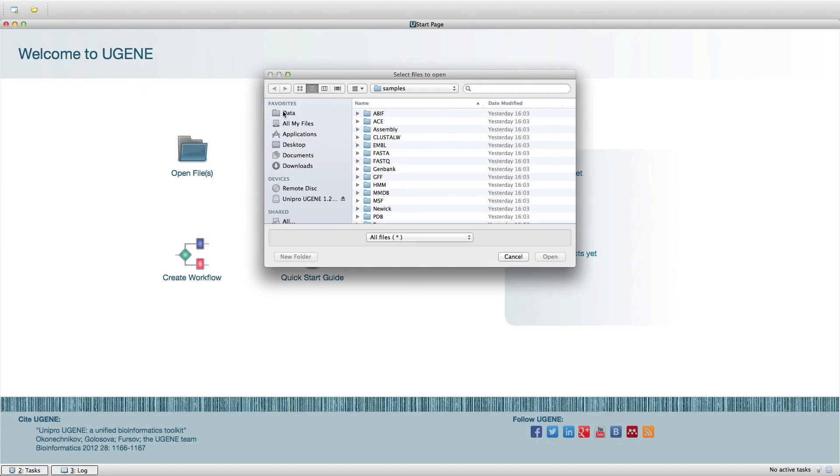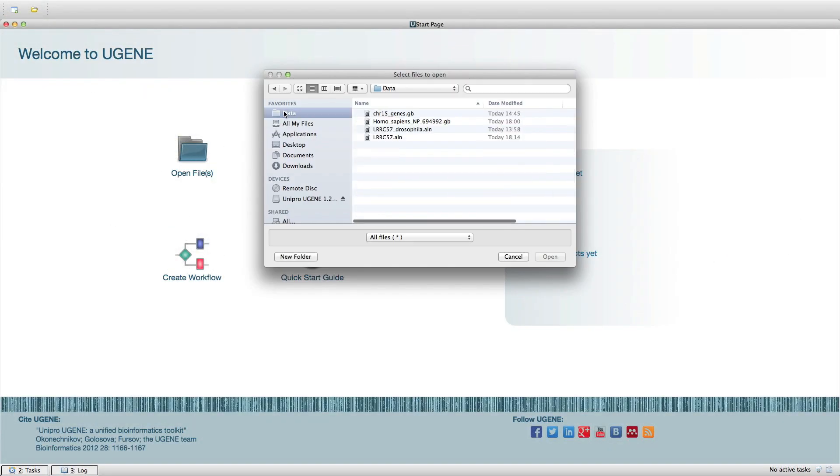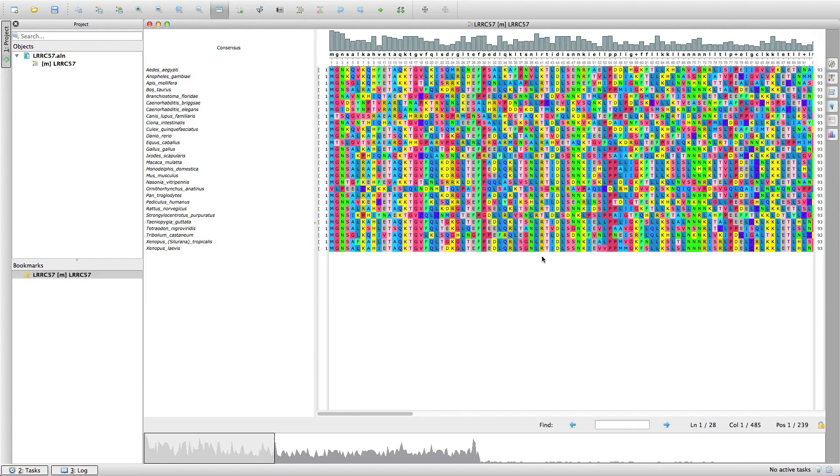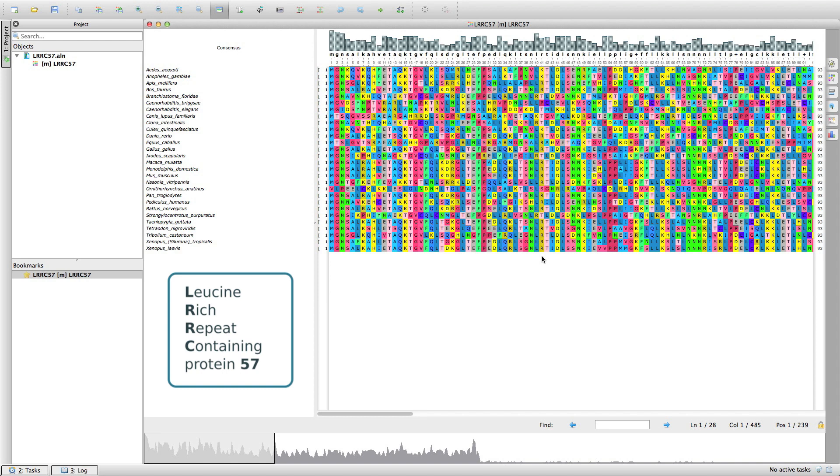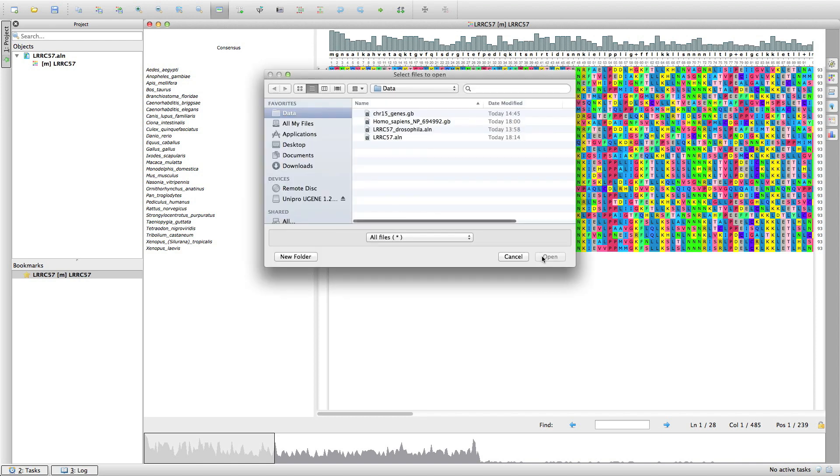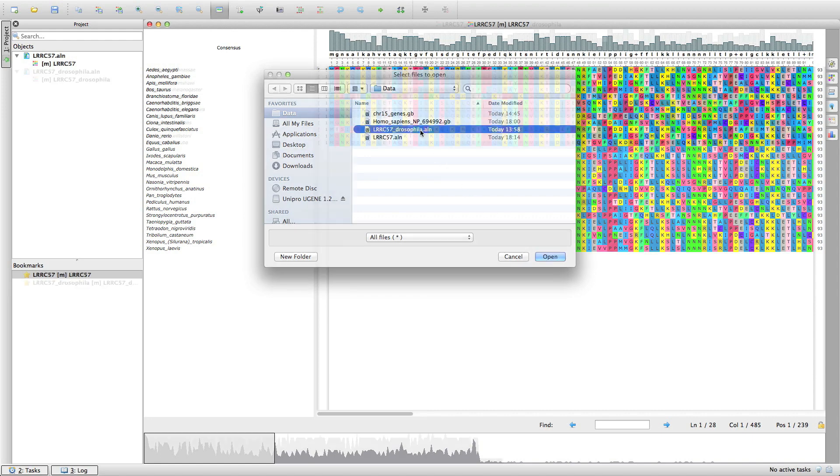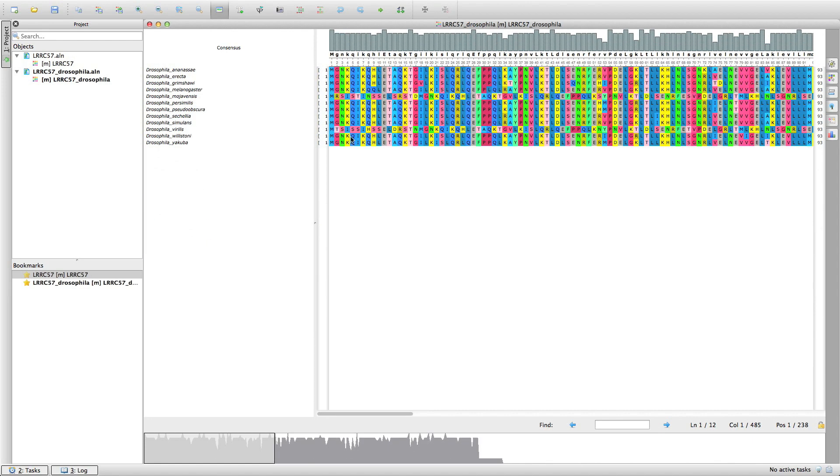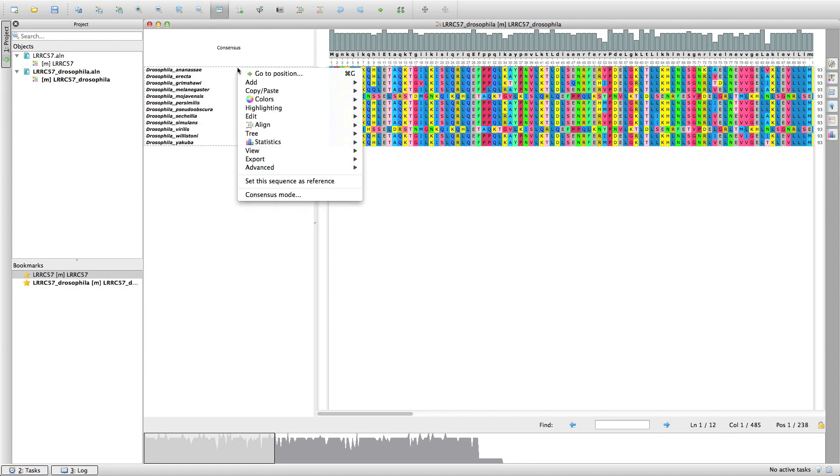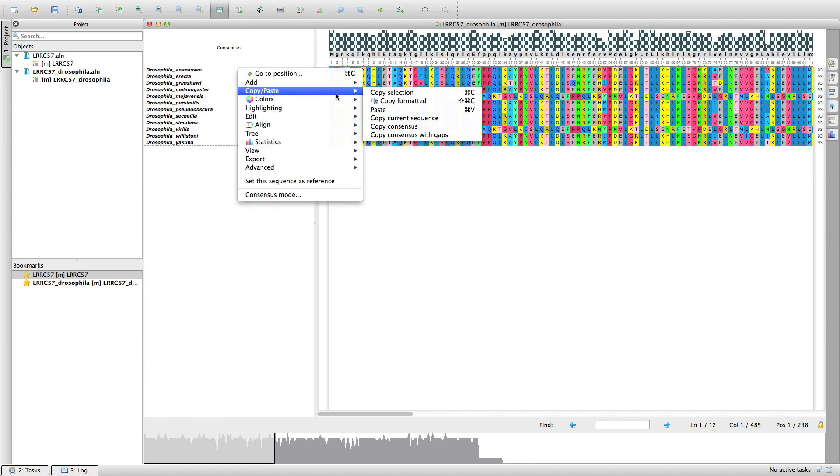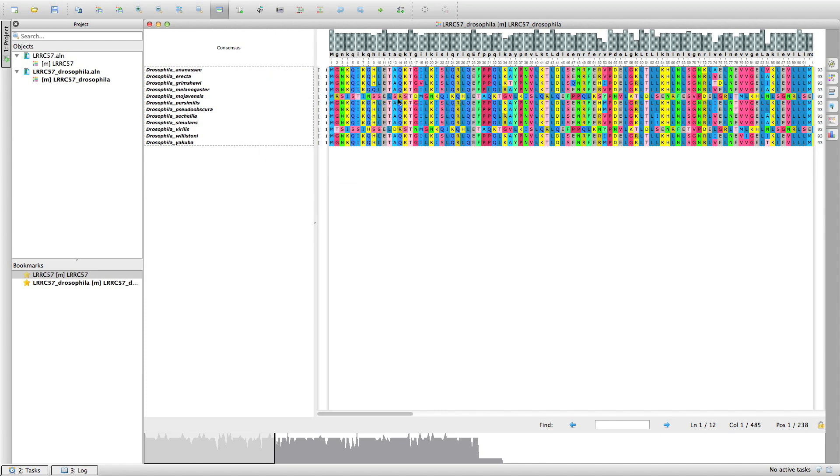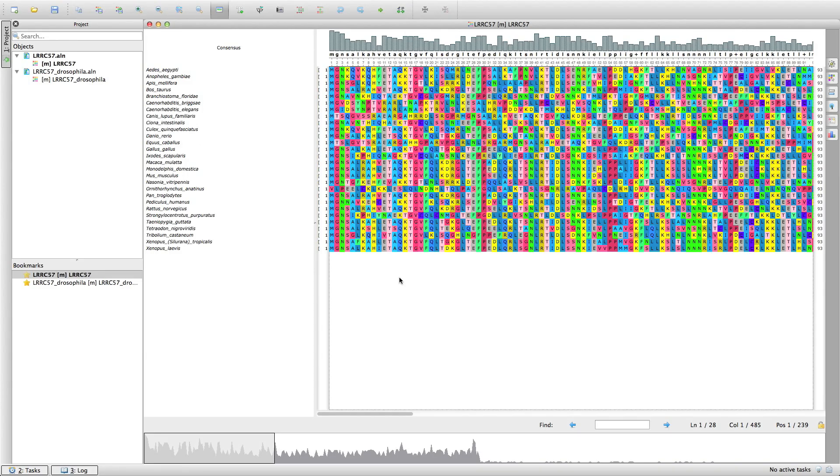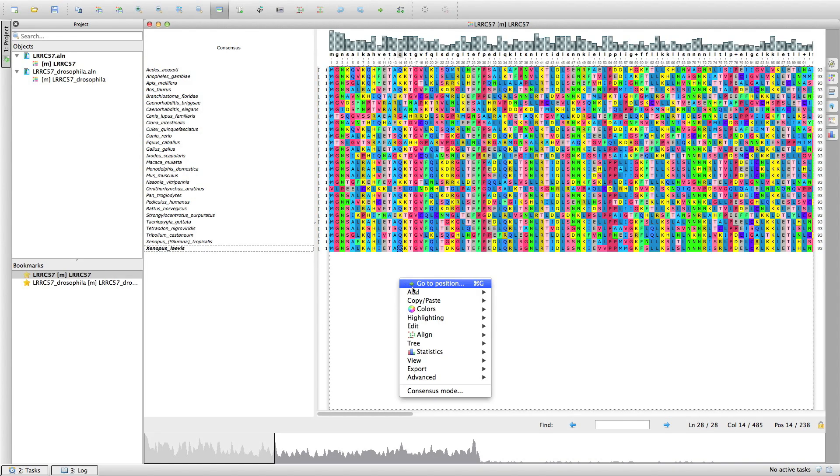Say we are interested in leucine rich repeat containing protein 5.7. Here we have an alignment of the LRRC57 amino acid sequences of different species. And we want to add a few LRRC57 of Drosophila. To do this we simply copy the alignment of Drosophila and paste it into the first alignment.